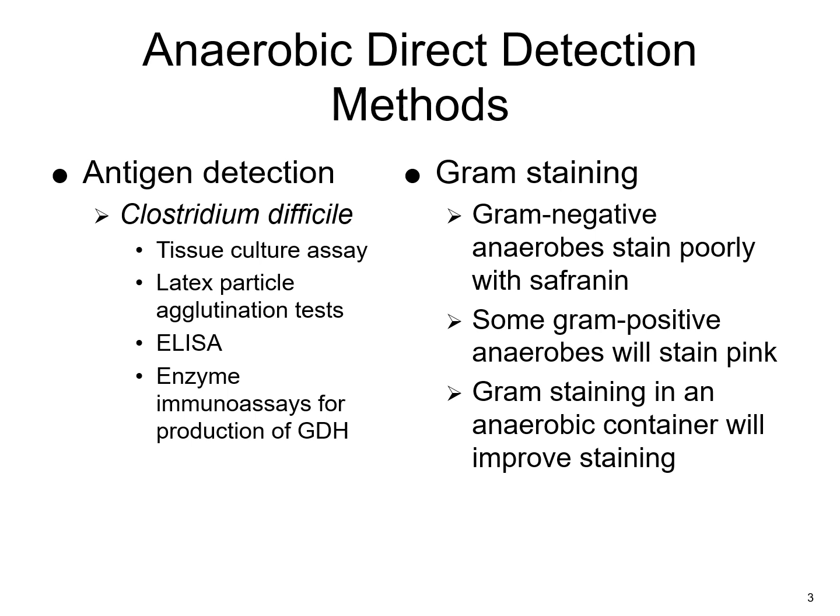So with a gram stain, your anaerobes can stain poorly. So sometimes staining them in an anaerobic type environment, which may not always be feasible to do, can help to improve the staining process and technique.